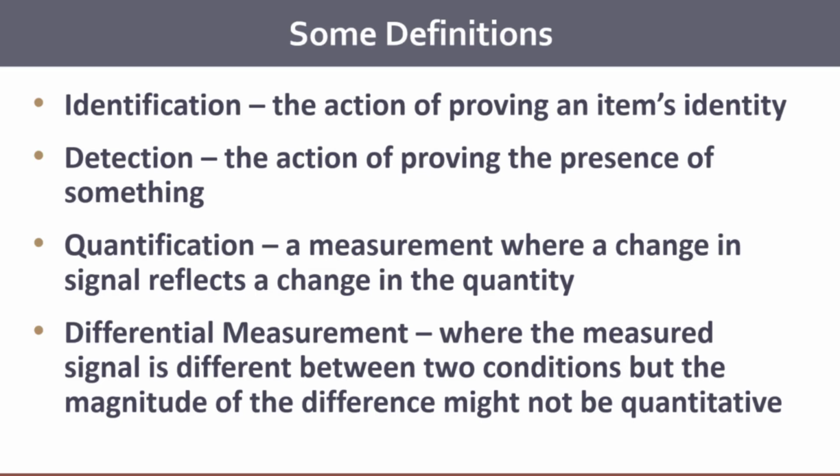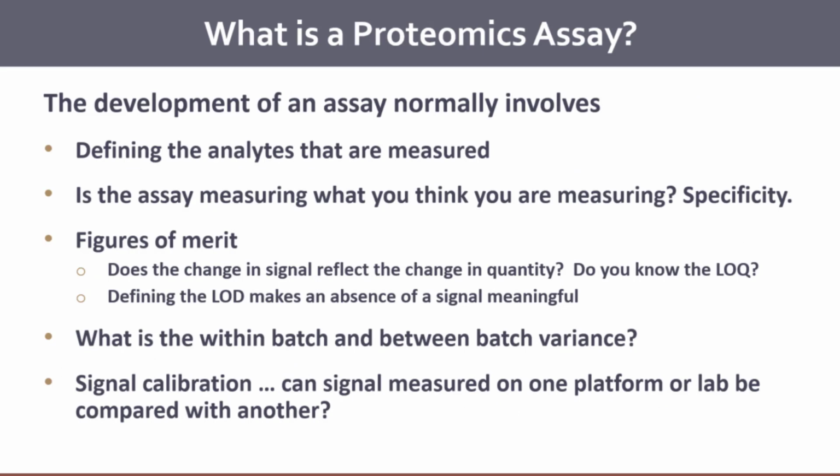This is a little bit of a different way of thinking about this, but it is definitely the way we try to define some of these terms. So I'll argue that a lot of quantitative proteomics is actually differential measurement, and that in a lot of cases where people say they identified something in a mixture, they actually just detected it in that sample. So anyway, I think that as a field we have to begin to think a little bit about terminology.